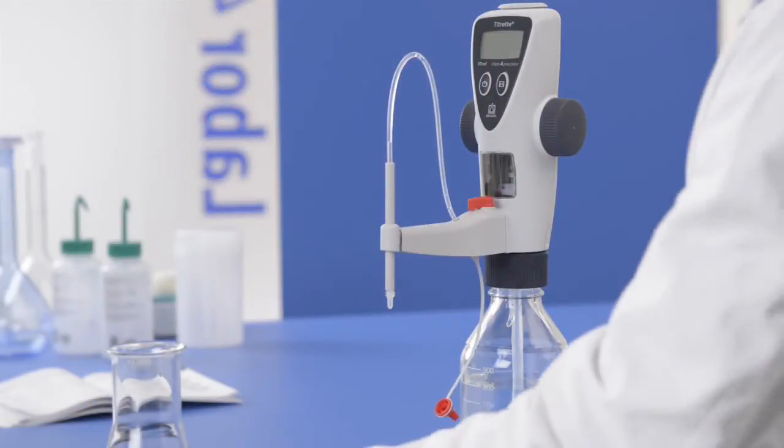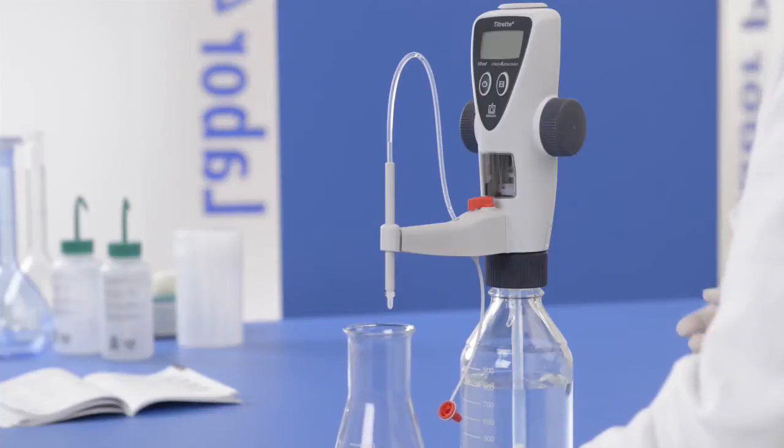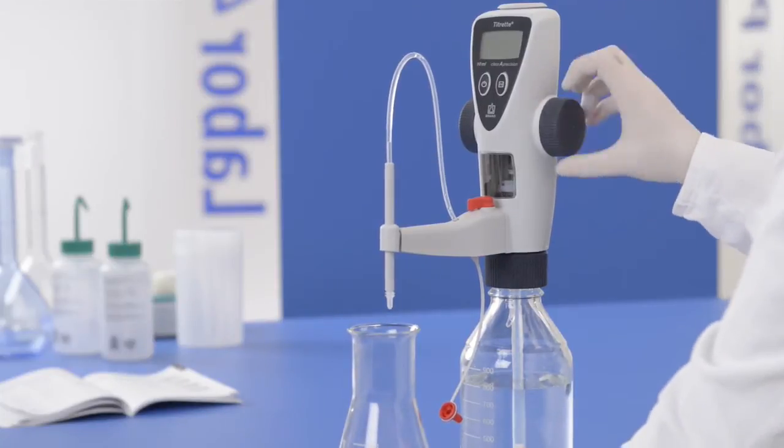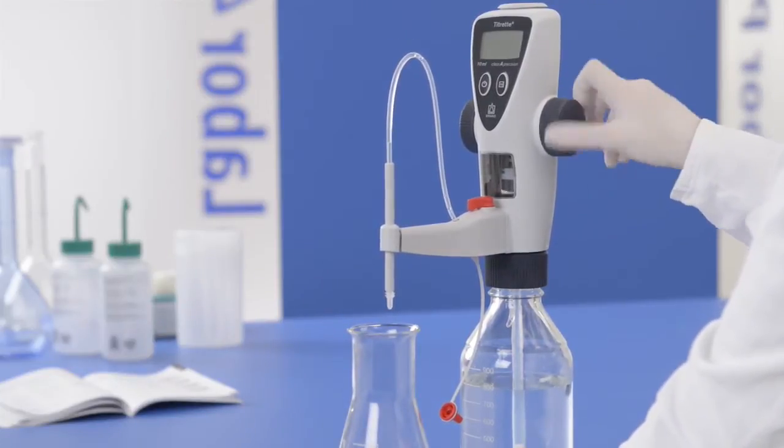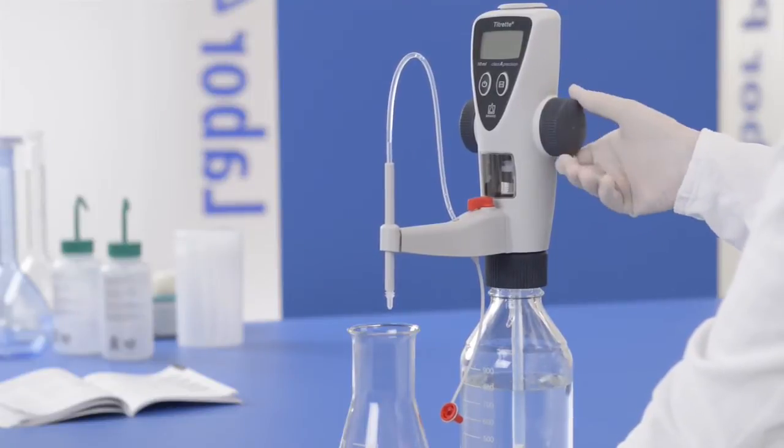To remove it, fill the dispensing cylinder once and empty it with the red valve set to 'Titrate.'